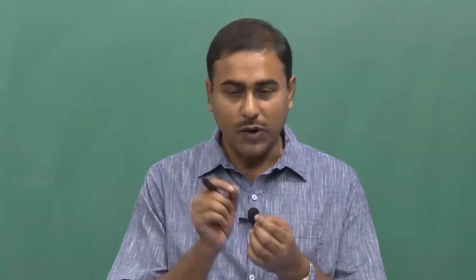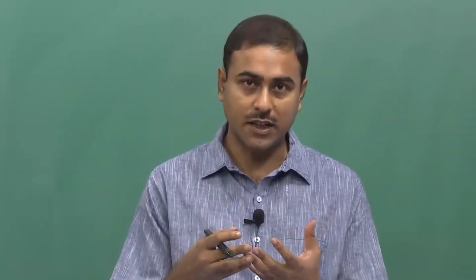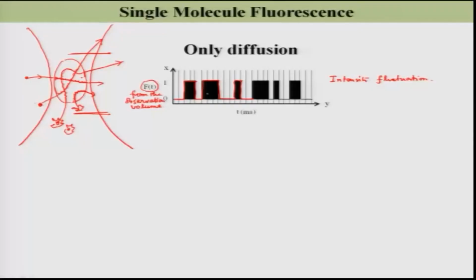So if I consider a very short time period, obviously there will be a lot of self similarity, right. If I consider this fluctuation now and this fluctuation after a very small time, the fluctuation should be very similar. Then there is a lot of self similarity. But if I consider this fluctuation and the same fluctuation after some time, then the self similarity will be lost.